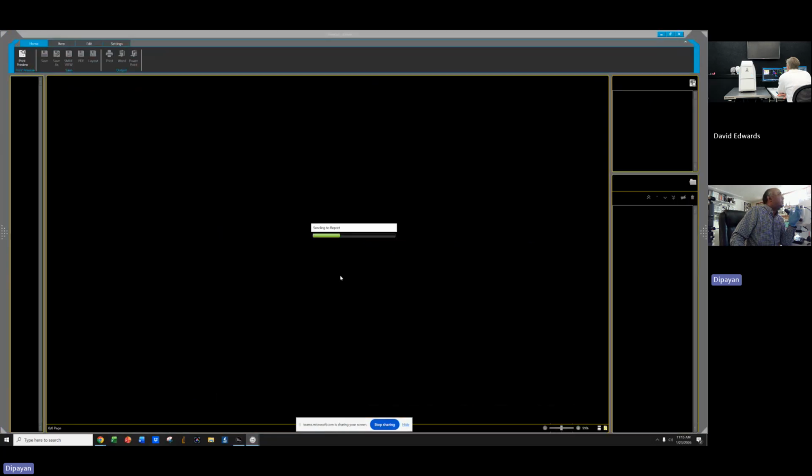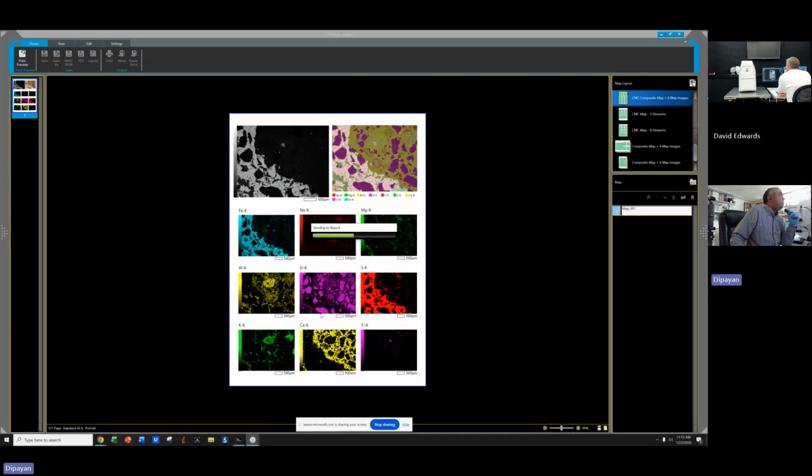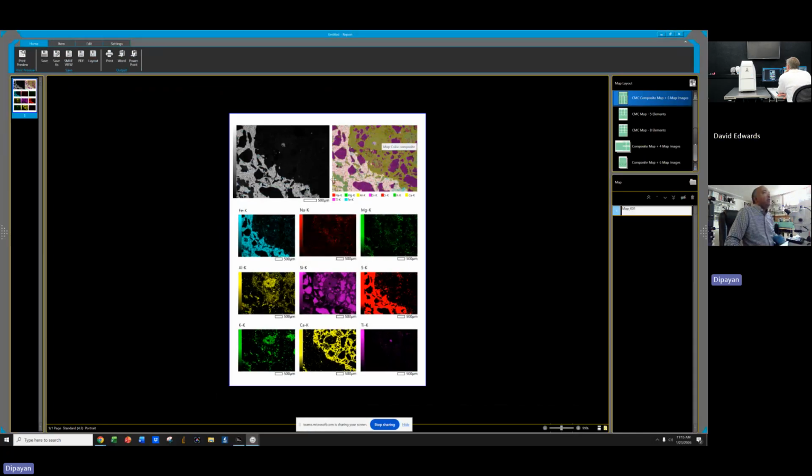Now let's go to the report. I should have only 1 page. Yeah, beautiful. So 1 page. So now my main goal is to improve this. None of these colors are there. You notice that. It's a composite color, but none of the elemental color is there. It's not like phase where it's one color or a different.